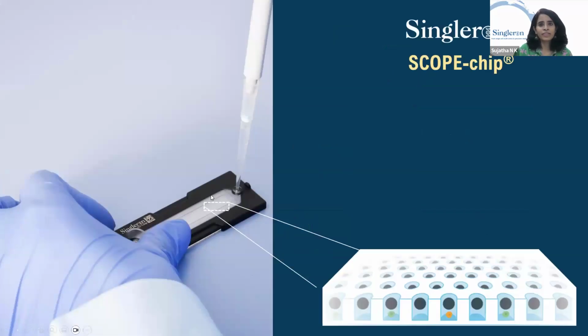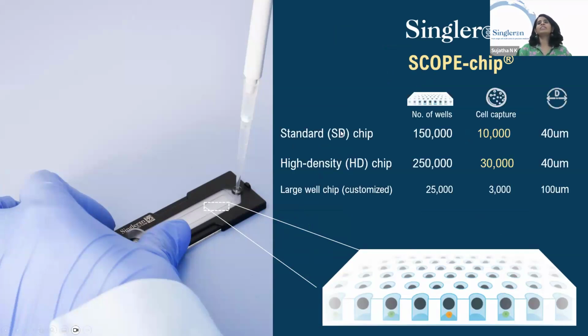If you put one of these chips under the microscope, what you'd see is that there are a whole bunch of wells on this chip. This is where the cells will be captured individually. We have three versions of this chip. The most common one used is the standard chip version. We have about 150,000 wells on this to capture up to 10,000 cells. The reason we have a lot of extra wells is to reduce the chances of doublets and multiplets.